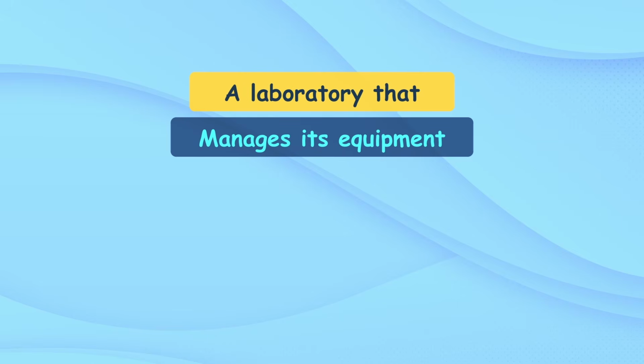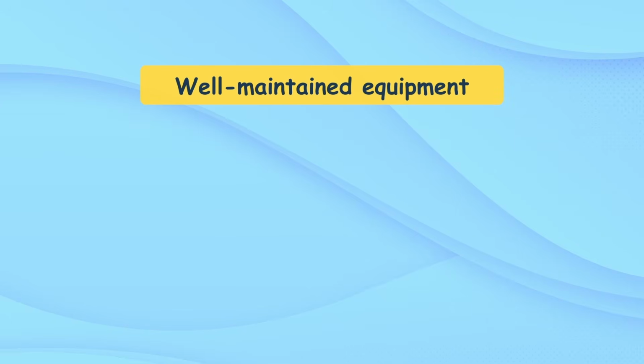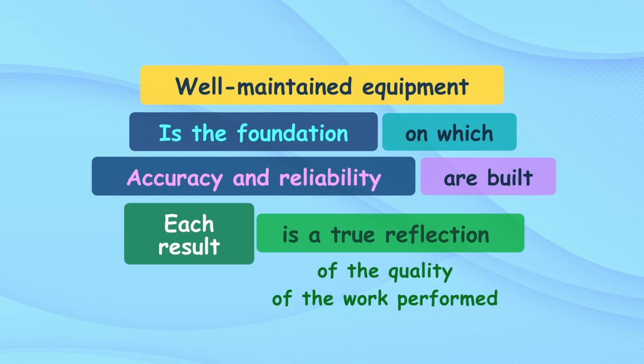A laboratory that manages its equipment with care not only meets regulatory requirements, but also protects its reputation and the confidence of its customers. Well-maintained equipment is the foundation on which accuracy and reliability are built, ensuring that each result is a true reflection of the quality of the work performed.